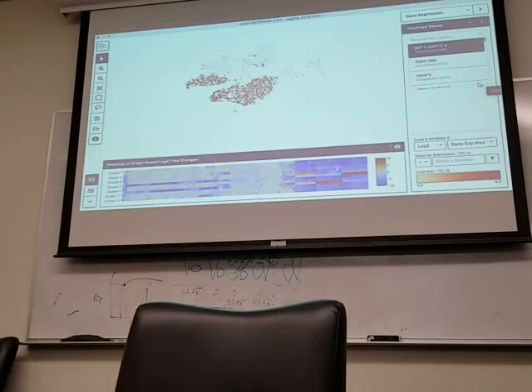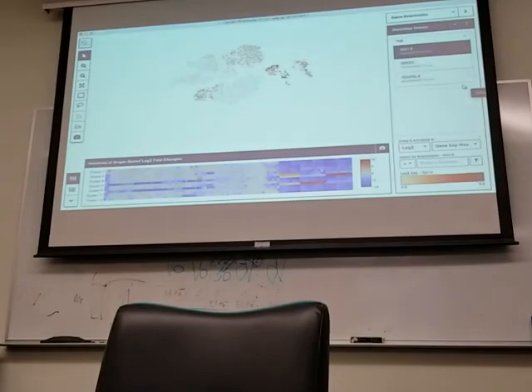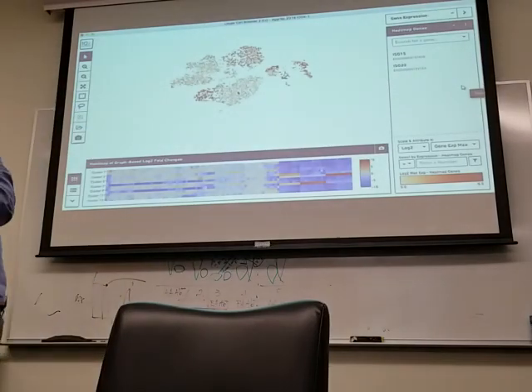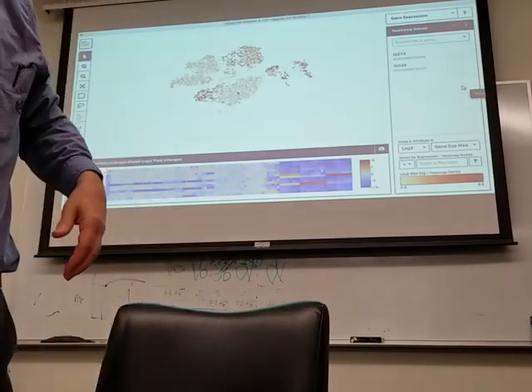ISG 15. Oh, he can't hear, okay. Right here. That's everything. And then what other? And then ISG 15, ISG 20, and then IFITM1. Sorry, I think because she's a little bit further from the microphone, I can't hear. Can you hear? 20, yeah, you have it there. Okay, we can get this closer. This is the microphone. That's the camera. Oh, it's also the mic. I think the mic's in this. Hello, can you hear? Yeah, I think there's a mic.